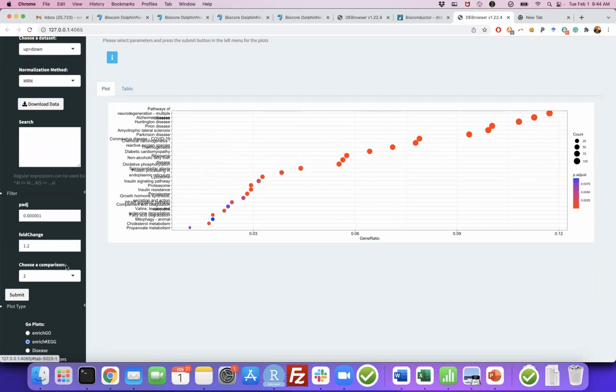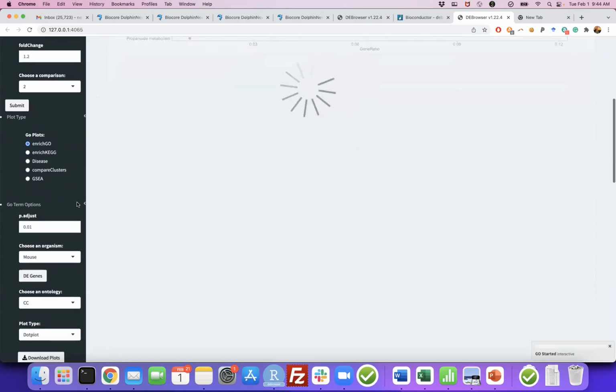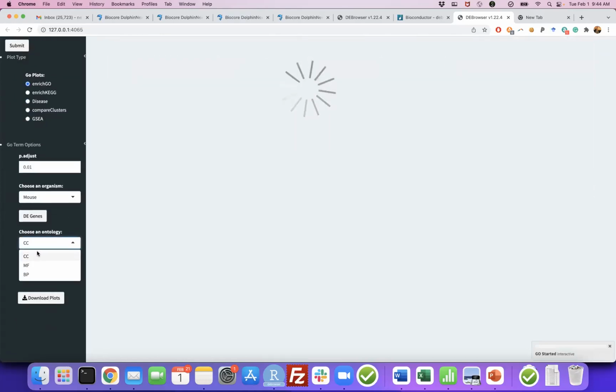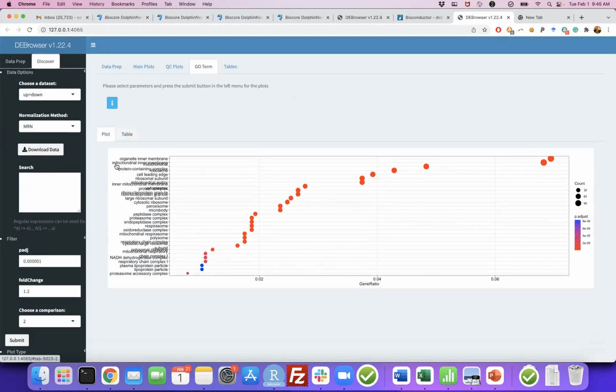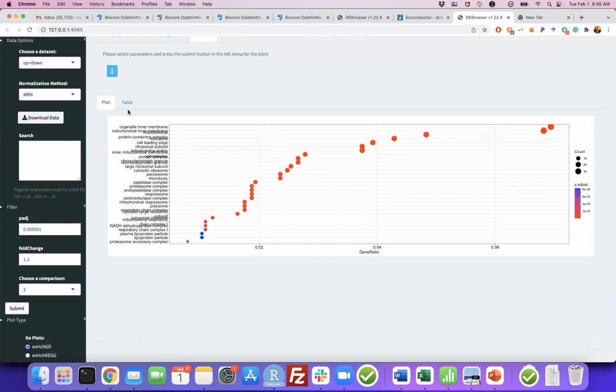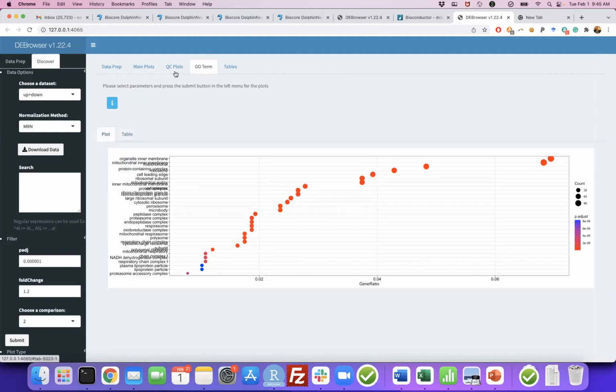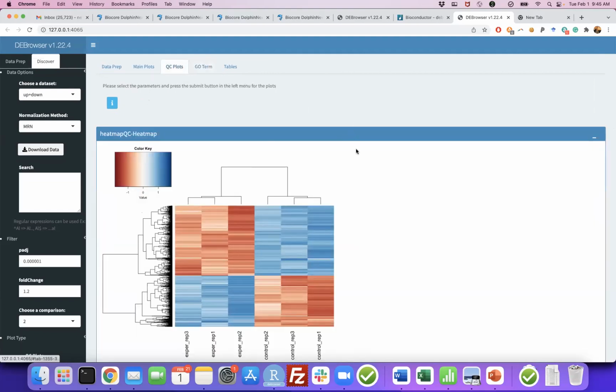All these GO categories here. By the way, in enrichGO, it's doing GO analysis now. You can choose the cellular component or molecular function or biological process. So you can change the ontology too. In this case, I did it with enrichGO with this ontology, and where it is in your cell, so you can get these kinds of lists too with GO analysis. I think I'm done.